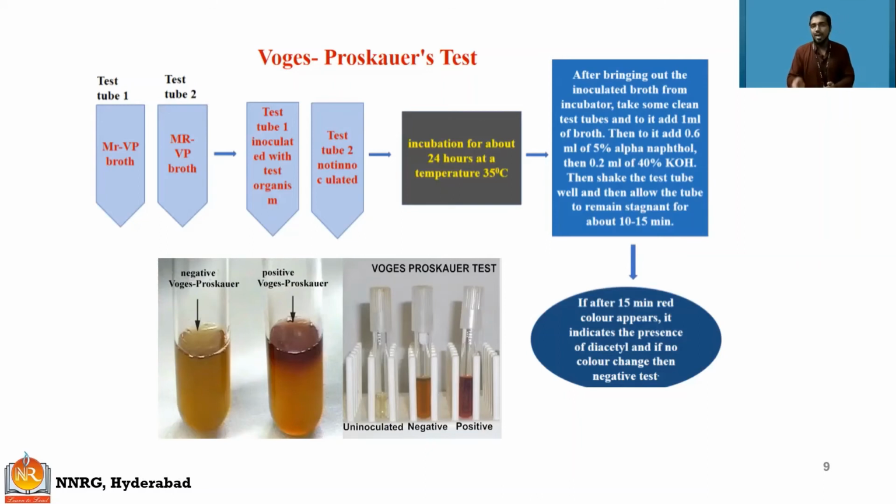Remain stagnant means let it stand for a few minutes. After 15 minutes, if a red color appears, it indicates the presence of diacetyl. If no color is present, then it is a negative test. What does it mean?